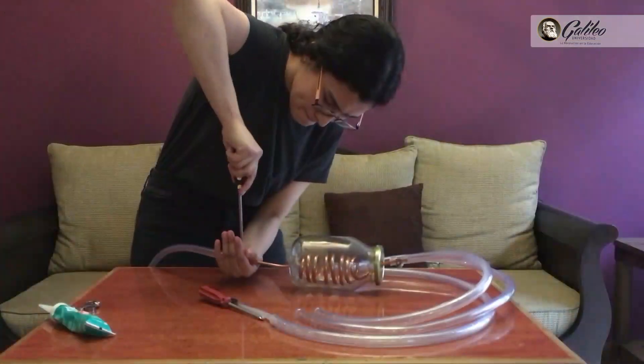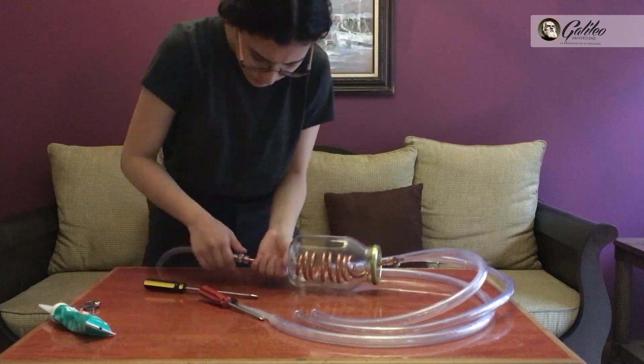Good afternoon. My name is Valeria Fernandez and I studied the degree in química farmacéutica and I'm in the second year. The project was called the construction of the distillador casero.